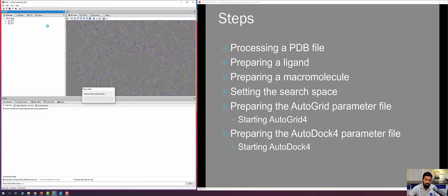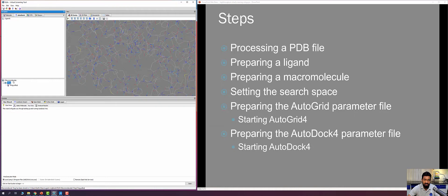I select the 1HSG entry, right-click, and choose AutoDock > Make Macromolecule to define this as the macromolecule. Going to AutoDock, I can see the 1HSG entry in the macromolecule section. This converts the PDB file into a PDBQT file, meaning preparing the macromolecule is complete. This is how to prepare the macromolecule in PyRx for virtual screening.